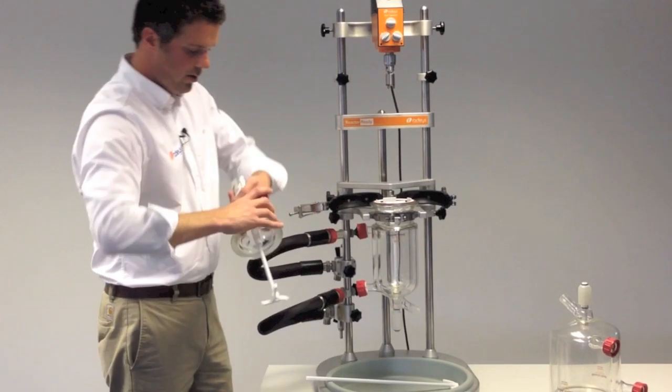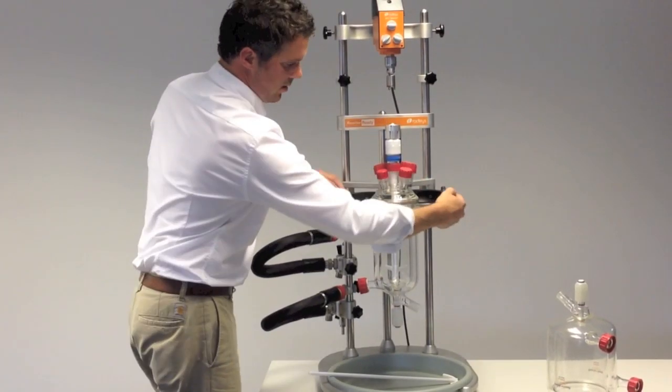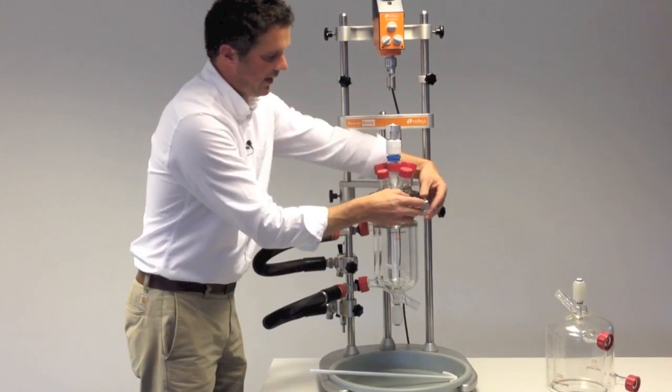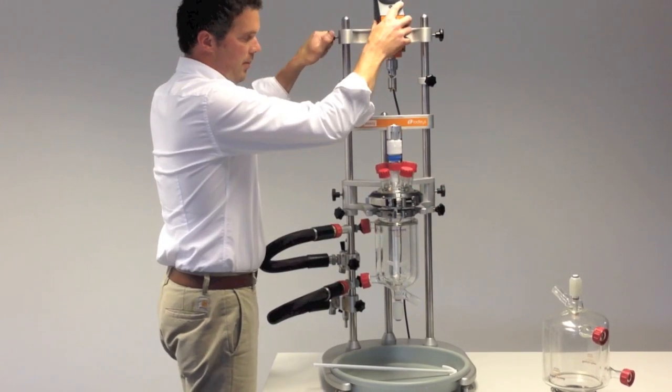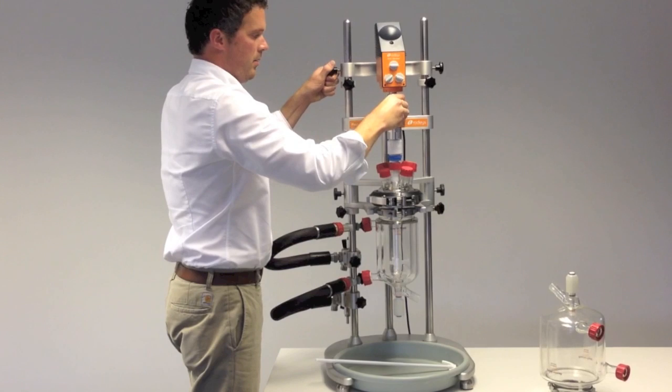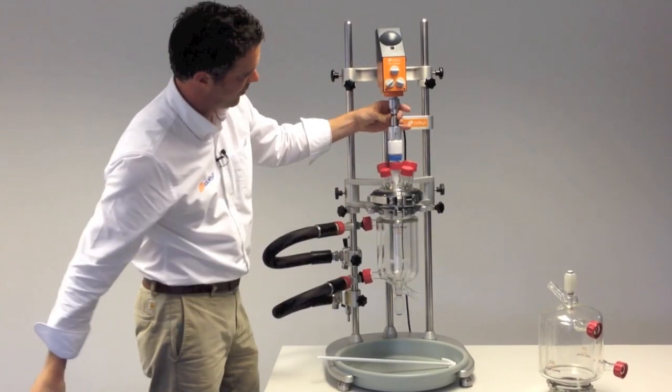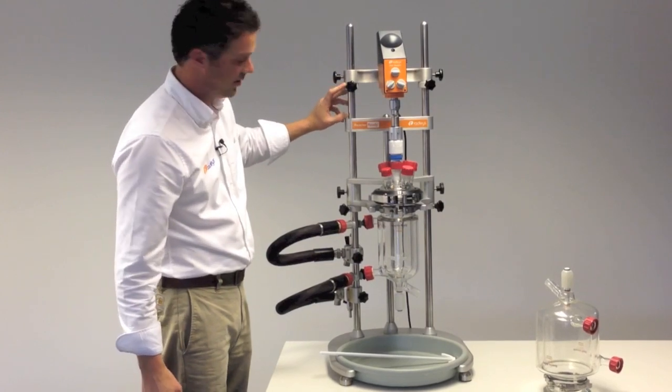The o-ring support collar. And then the quick release clamp just brings that all together and gives a good seal. Then we can drop the stirrer motor back down and you can see that everything's lined back up and it's just dropped back down to the support collars on the framework.